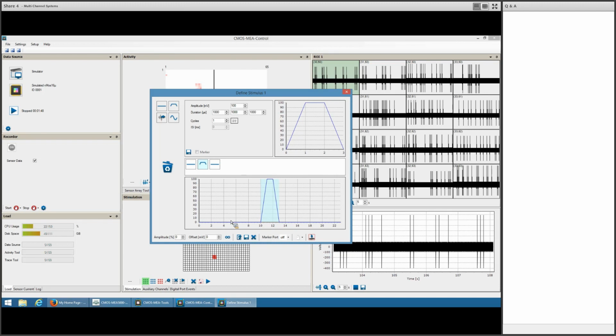So if you want to have a current pulse negative, positive, then what you would have to program is actually this, a simple triangle. So this voltage triangle will give you a negative, positive current pulse. This can also be repeated indefinitely and combined into more complex patterns, but that's the general principle. The 3 different stimulation lines can either be started manually, they can be started together, or they can be started on external trigger events.